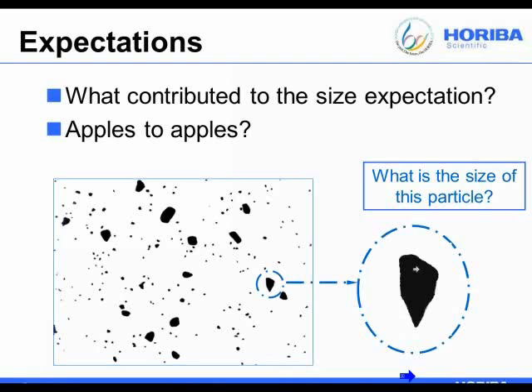If you have a material that's measured in a laser diffraction instrument, again, it will take the volume of scattered light from this particle and calculate what the equivalent spherical diameter is. If you have a DLS instrument, it's calculating the hydrodynamic diameter, which is the particle surface plus whatever else that particle might be dragging along with it through solution. So if you've activated the surface, if you have something bound to the surface, or even if you're just dragging ions through solution, the hydrodynamic diameter will report larger than the other diameters.